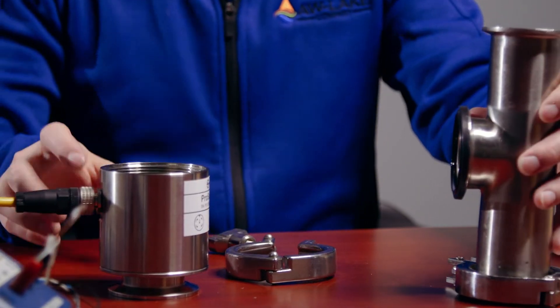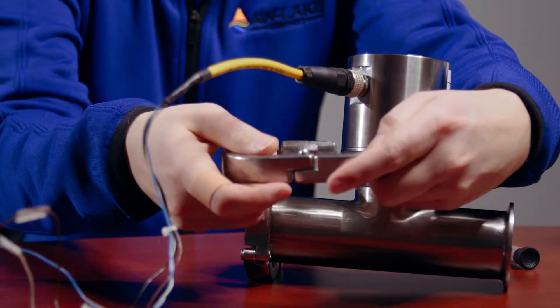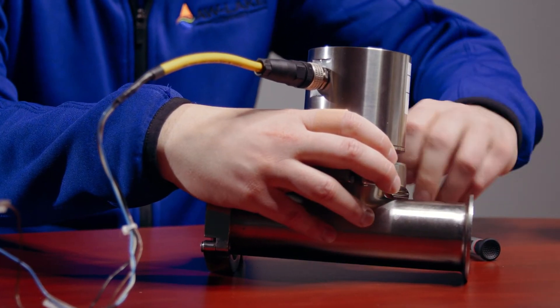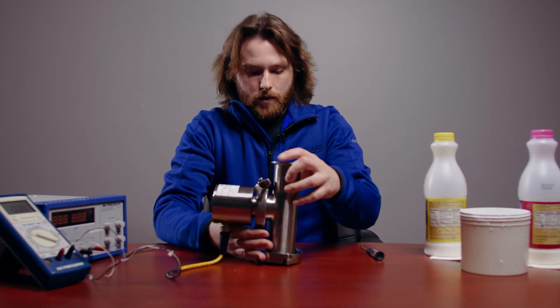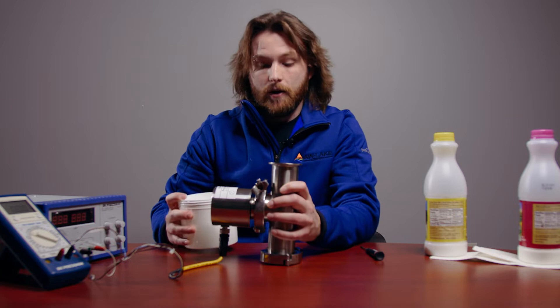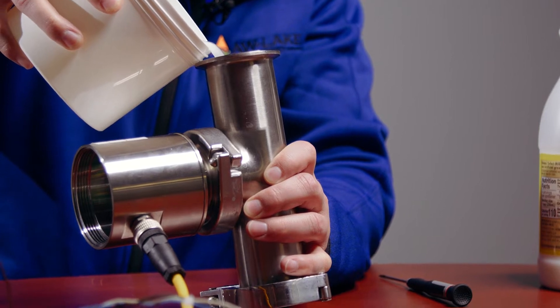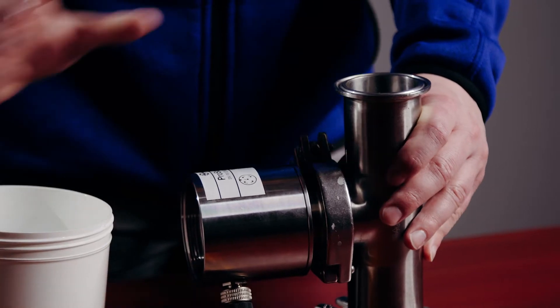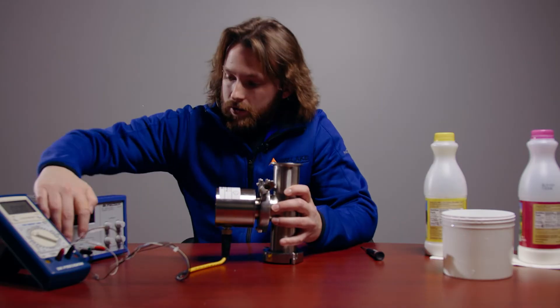First, attach the ProScan to your tee. If you don't have a tee, you can do it inside your process. When pouring your sample into the tee, be sure to pour slowly so that no air bubbles are in front of the sensor. Be sure to cap your tee to avoid any external light from getting in. Once your sample is in your tee, you can turn on the unit.